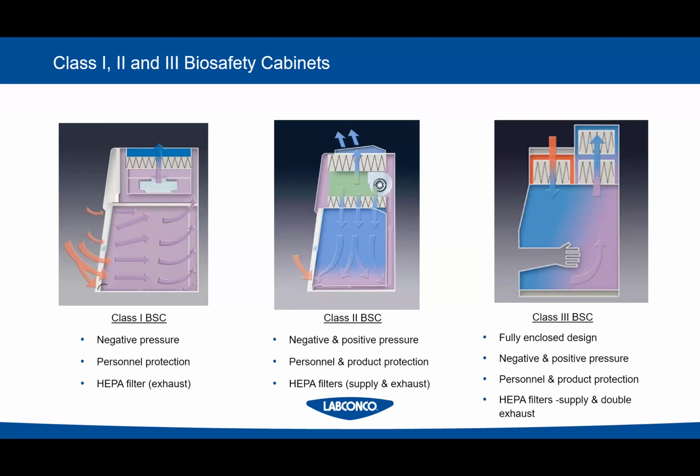You can't decon a powder, right? You can't really inactivate them the same way you can a hood that I can go in there and run some decon gas through it and know everything's good. So we don't have a bag in, bag out on this unit.